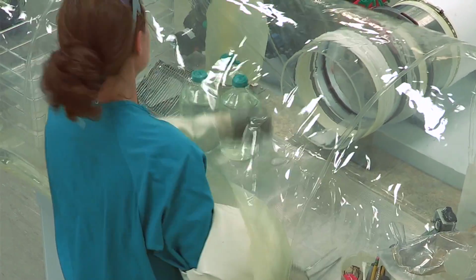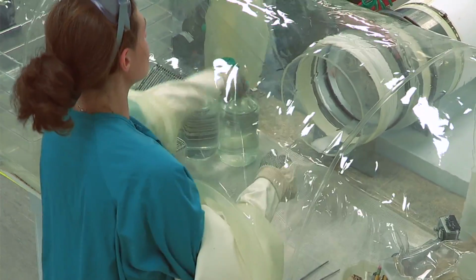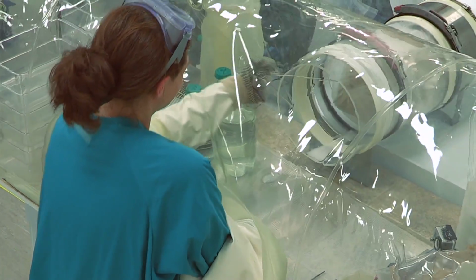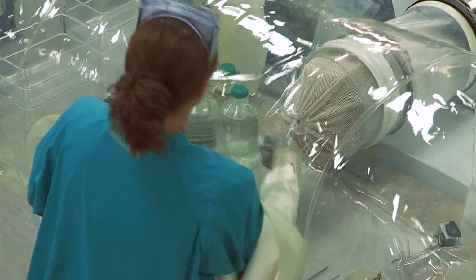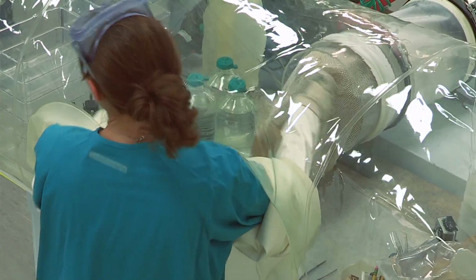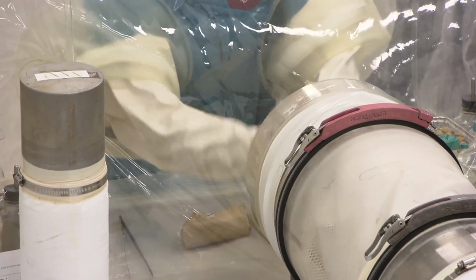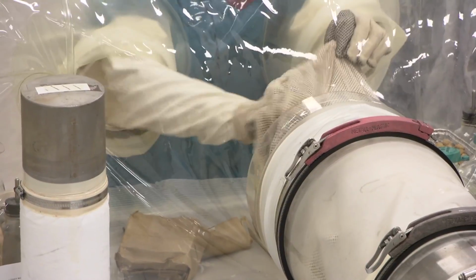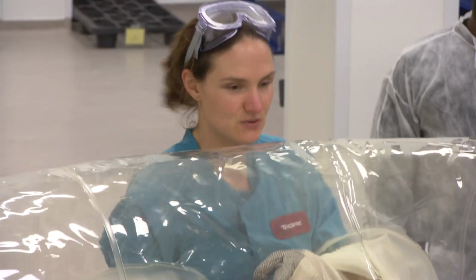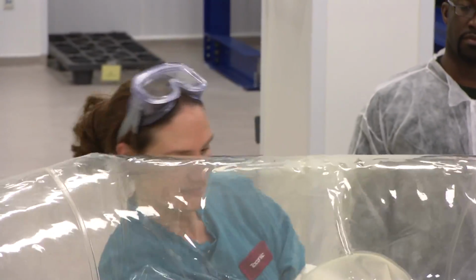Okay, you can go ahead and grab it. And I should have told you to stay there because now I need someone to pull it back for me. So we keep all of our supplies in a mesh bag with this string, so it's just easy to, you can go ahead, pull it on back. So it's a little bit easier to get them all in. Prior to the mesh bag, you would just have to sit here and have somebody shake the end of your cylinder and shake everything in. There is a tray in here, but we don't slide the tray back and forth through the sleeve, so we just use the bags.